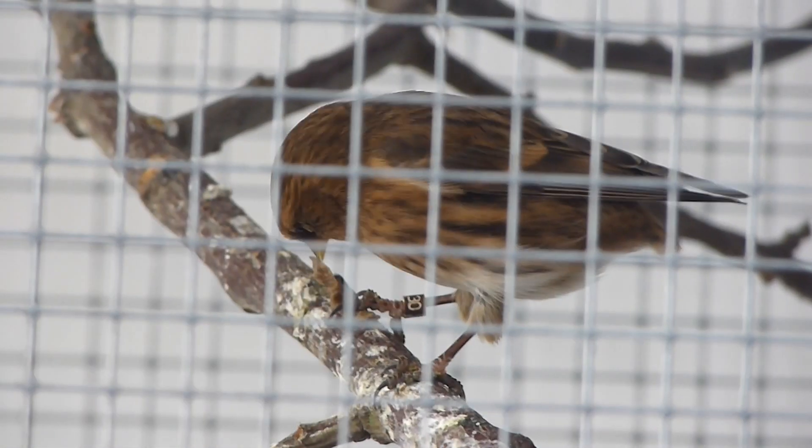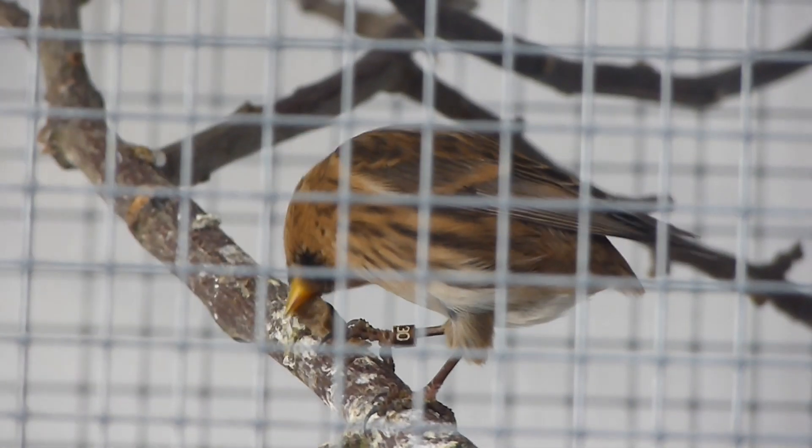Hi everyone, welcome back to OC Avery today, where we're going to be taking a look at DNA sexing for our birds. I'm going to run you through the various bits of equipment that you need and the whole step-by-step process that I undertake when I'm sending off samples for my birds to be DNA sexed.